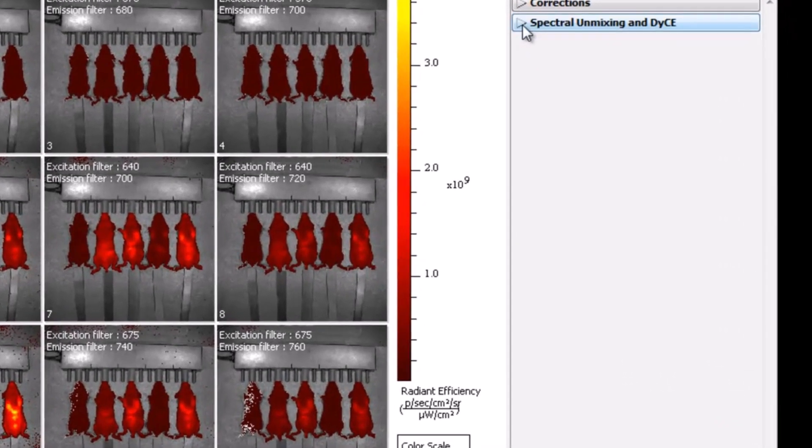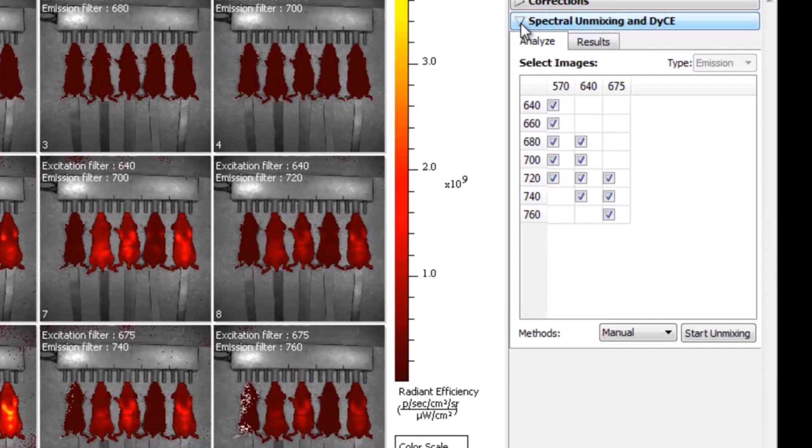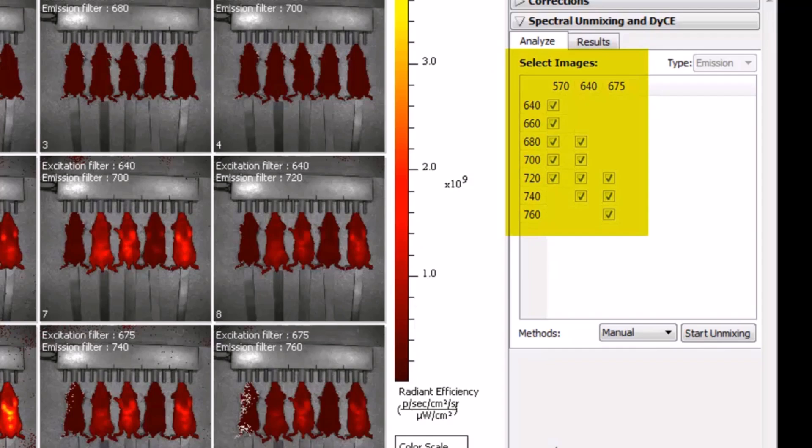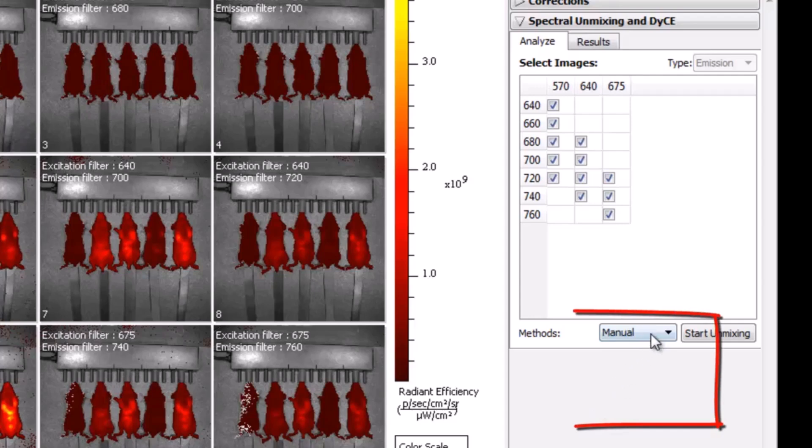Apply the adaptive fluorescence background subtraction correction from the corrections tab in the tool palette. The calibrated unit we use for analysis is called radiant efficiency. Select the unit from the upper left hand corner of the image window. We are now ready to create the spectral library. Open the spectral unmixing tab in the tool palette. You will see all combinations of excitation and emission filters that were used to take the images in the sequence. If any saturated images exist they will be deselected automatically. In this video we will use the manual method to create and save our library.